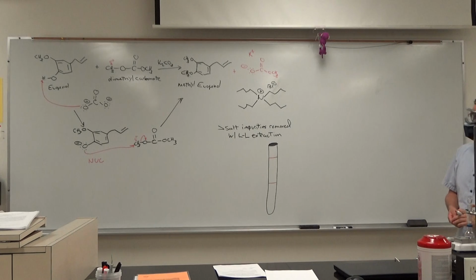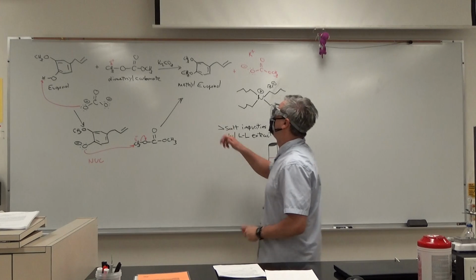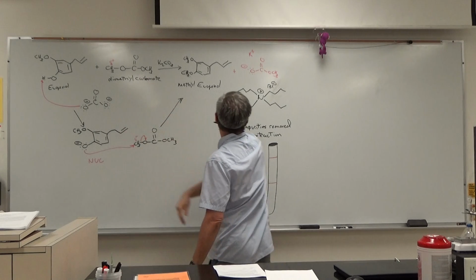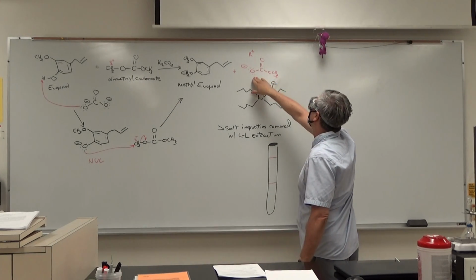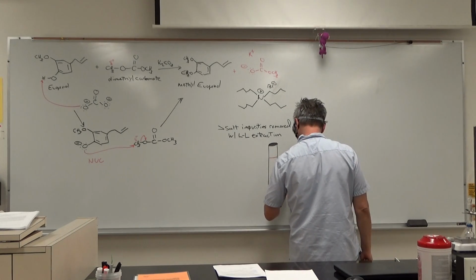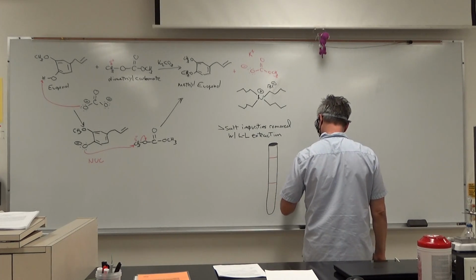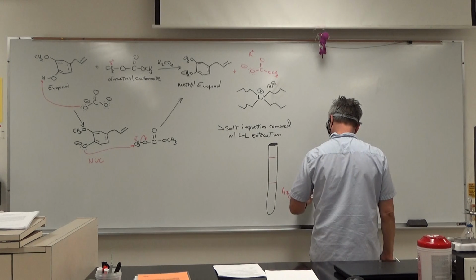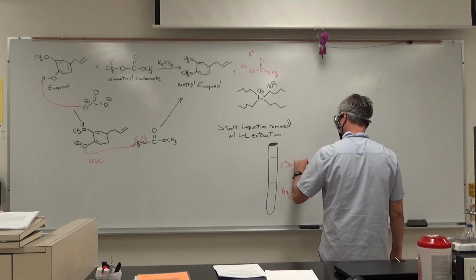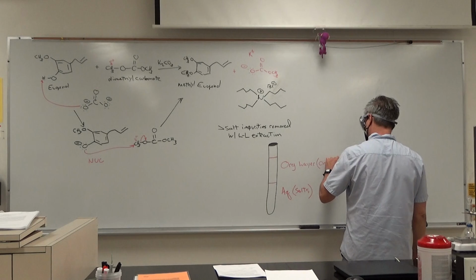You're going to add a bunch of water at the end. Dimethyl carbonate is soluble in water. Potassium carbonate, all this is soluble in water. So we have our aqueous layer, and that's where our salts go. And then we have our organic layer, then this is our organic compounds.